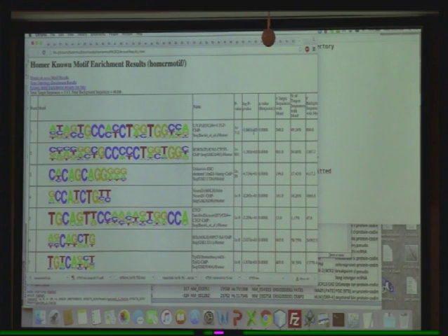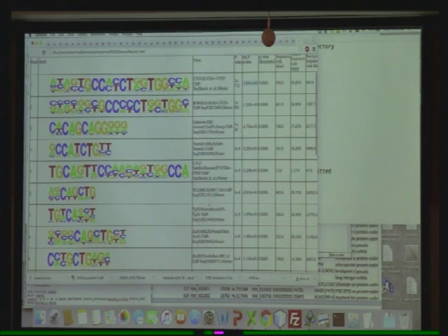If you don't know what the transcription factor is that binds in these regions, you can go through the other ones and look, because it'll call other ones as well. And if it's a longer region that has a motif, there could be multiple different factors that all come together to bind to that region. So you can look through these known motifs and try to make sense of your data to say what transcription factors are regulating these regions.